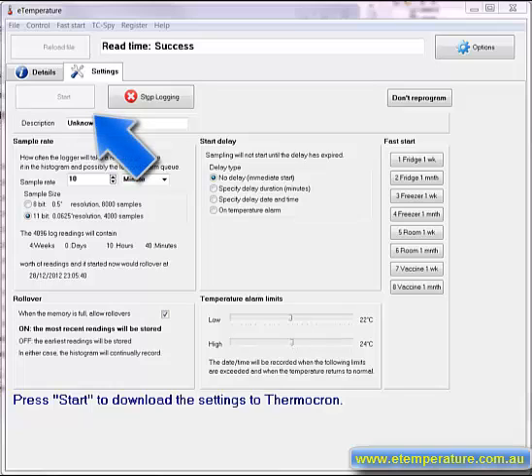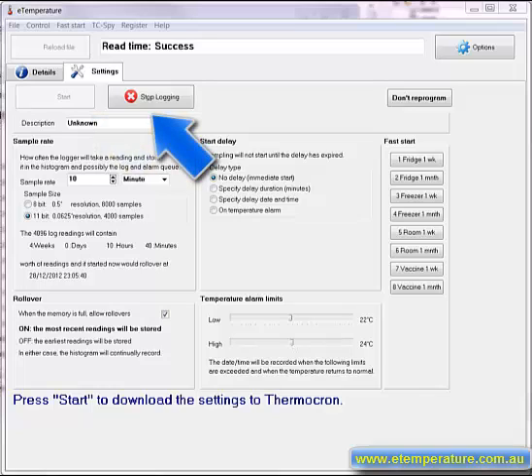Once the settings have been entered then press the start button. If the start button is not available then press the stop logging button first and then the start button. If you have enabled rollover then you will probably only need to program the logger once.